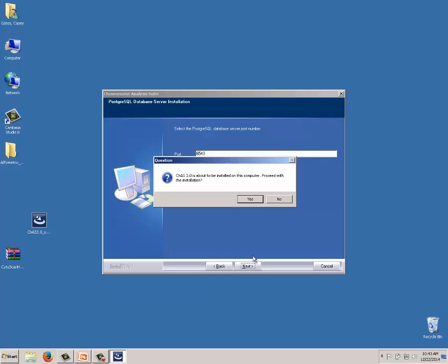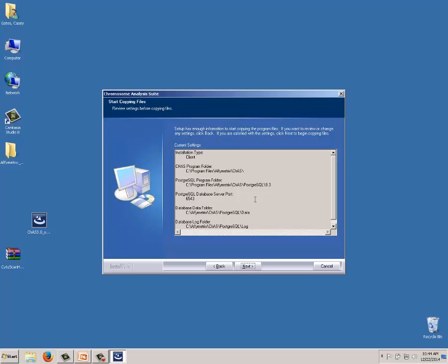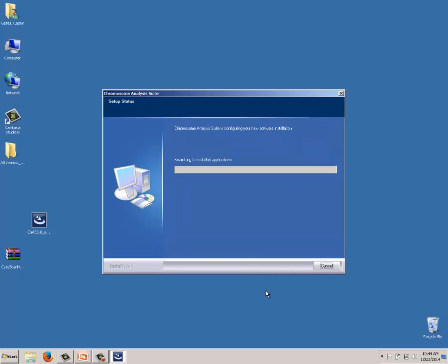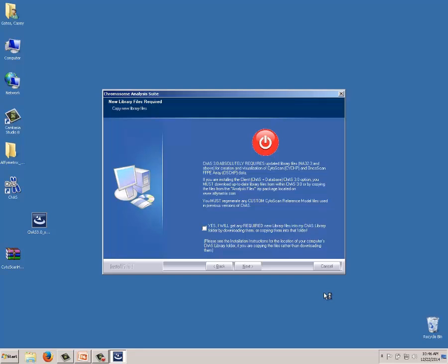It confirms it's ready to install. The last screen shows a summary of where everything will be installed: the log files location, the Postgres database folder location, and which port is being used. I click Next and the installation runs — about two minutes for a clean install. The final screen gives a prominent reminder that it is absolutely required to download new library files. Check the box confirming you will download them, click Next, and CHAS 3.0 is now installed.